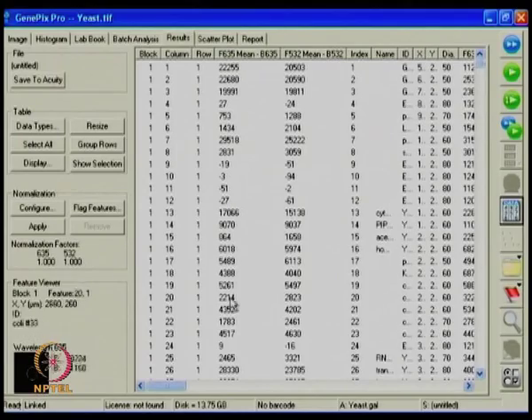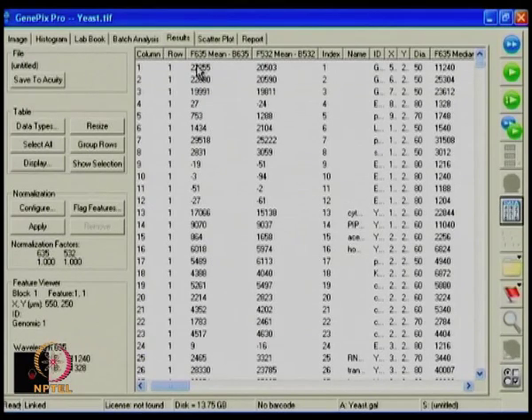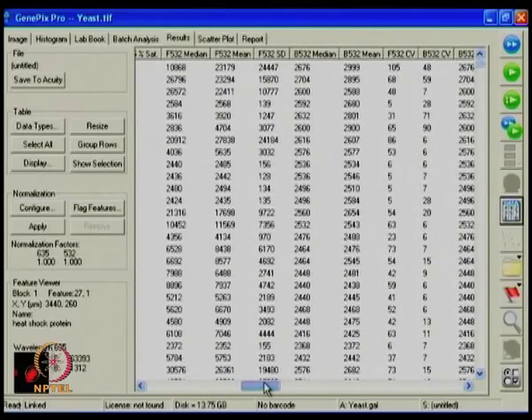Just quickly looking at the major ones: F means the intensity from different channels, 635 or 532. The background calculation is done accordingly in the same laser range. Once you do the corrections, you want to correct your intensity mean values with the values of the background. This is the most important, which people usually use for further calculation, apart from the ratio of means or ratio of medians, which are presented to you in different column formats.